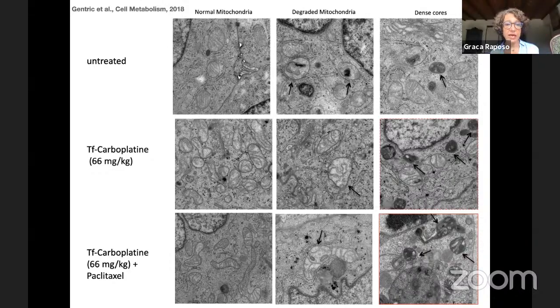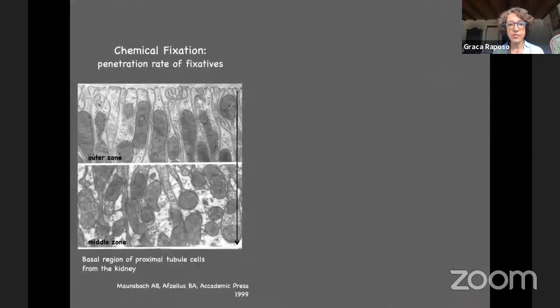So you have on one hand the normal mitochondria on your left, and then in the middle you see the effects that these agents have on the mitochondria. And again, we could do a statistical analysis that you can see in this paper that I've put here for reference.